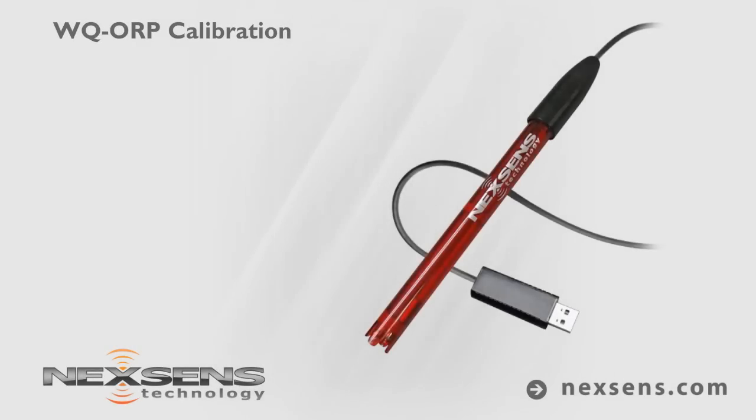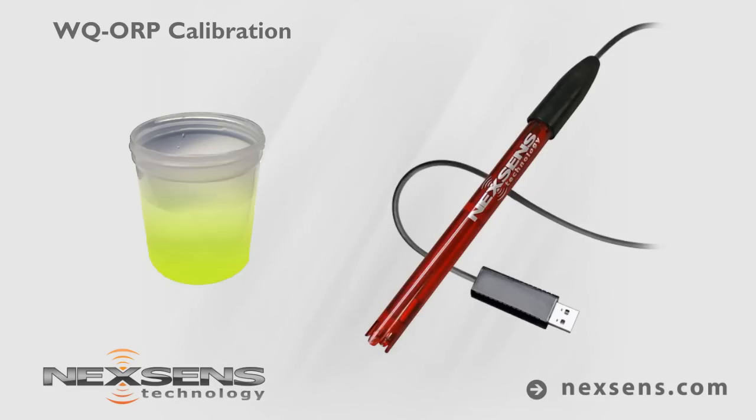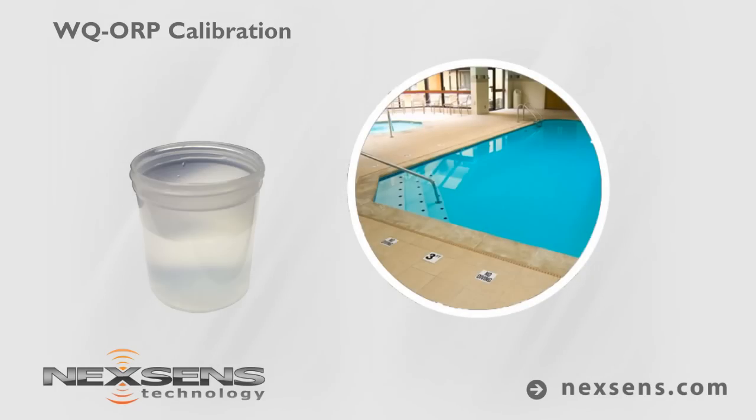Calibration and measurements with the NexSense WQ ORP sensor are quick, easy and reliable. The software supports a one-point calibration in a known ORP standard solution. For this demonstration, the sensor will be used to determine the ORP of water from a swimming pool with an expected range of 650 to 700 millivolts.